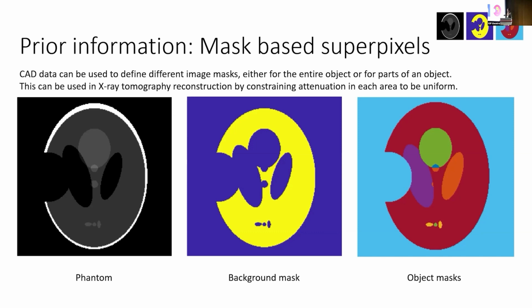Instead of having voxels, we just have these big clusters of voxels. So here the underlying is still a voxel, but we grouped all these voxels together. Each part of our object that we know exists, we just give it one gray value. It's a group of voxels, but all these voxels share the same gray value. And I called it supervoxels, but whatever we want to call it.